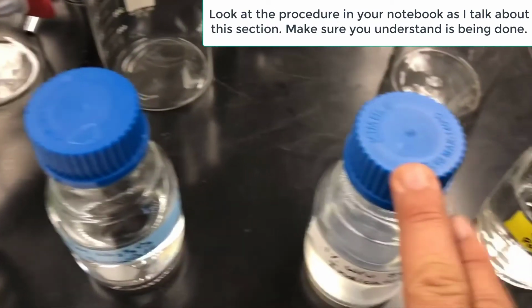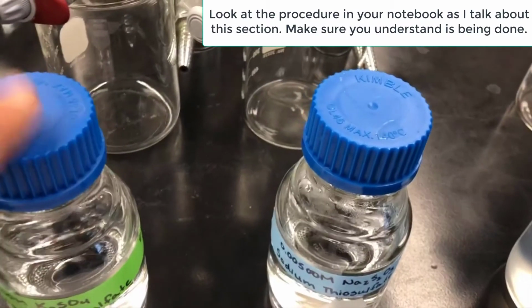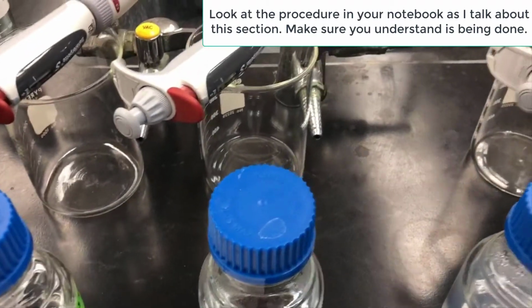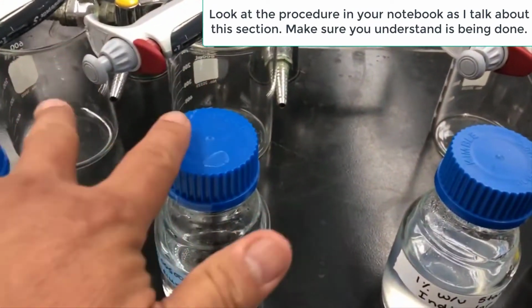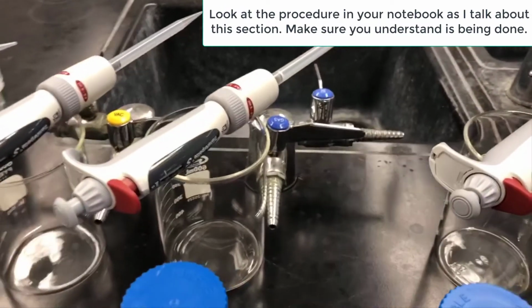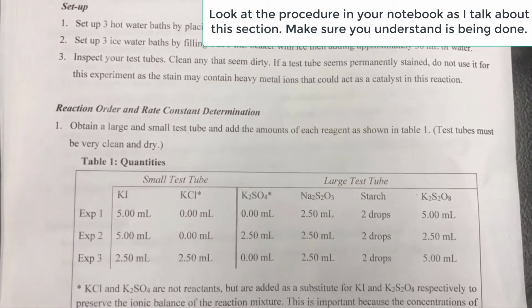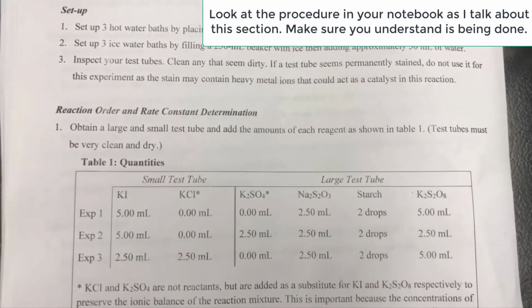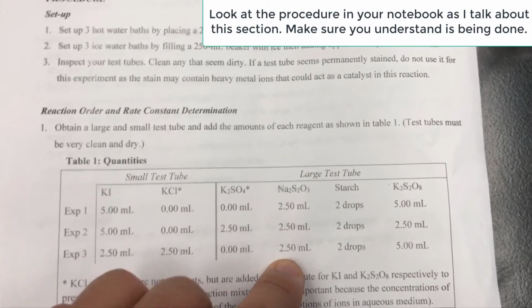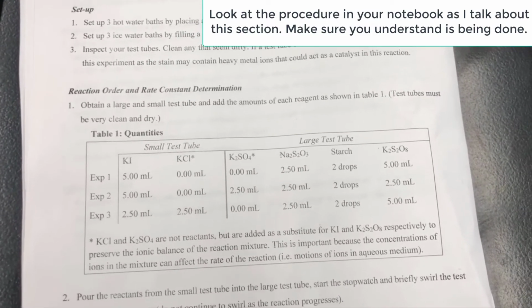And this one just takes a dropper. This is the starch indicator, but this is your sulfate solution, your persulfate, and that kind of stuff. So that's your other, not persulfate, no, I almost said thiosulfate solution. Other thing I wanted you to notice is, remember, the thiosulfate is what we'll be using for the timing of the reaction. That's the only one where the volume is constant throughout.